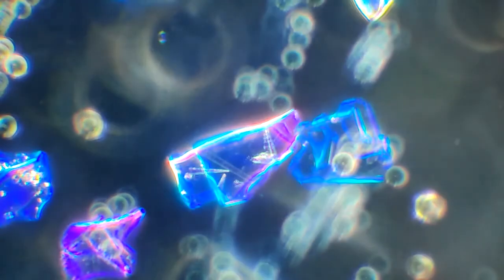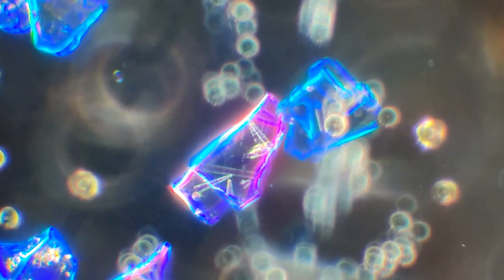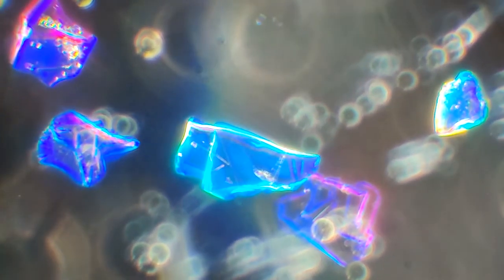Now let's move over to the central stop dispersion staining lens. Closing down the field and the substage condenser iris, you can see the colors become very vivid. Quartz in 1.55 will show a brilliant blue to magenta coloration.